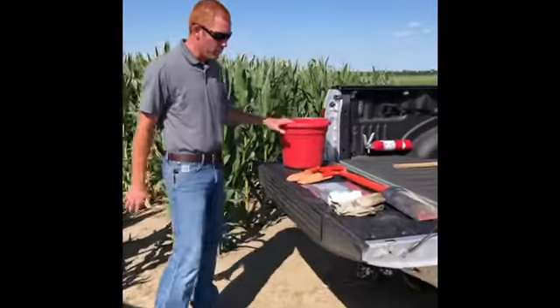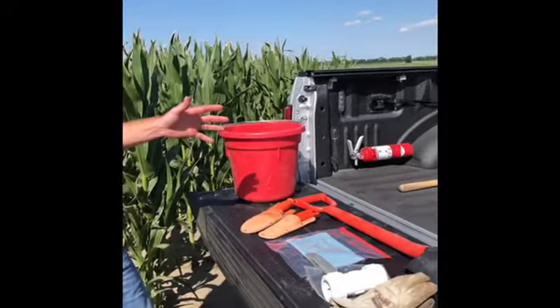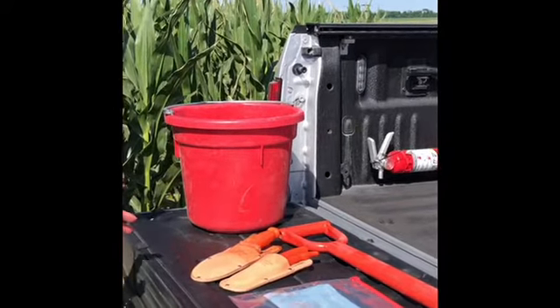If there are some diseases or challenges out there you're not aware of, there are a few things you can do to try to make sure you get a fresh healthy sample to the lab so they can help you get it diagnosed. Here are just a few tools I carry with me — a bucket to try to get, if you're looking at any root issues, make sure you get that out of the field. In some situations you're going to want the soil attached with the roots before you get it to the lab.